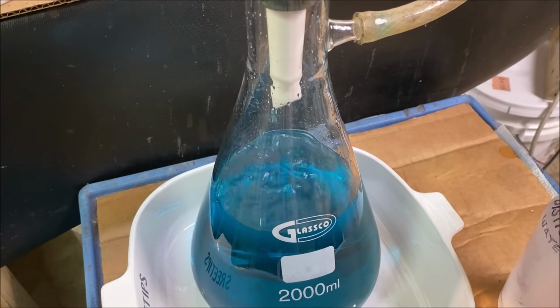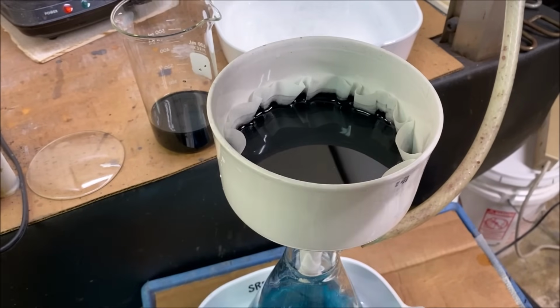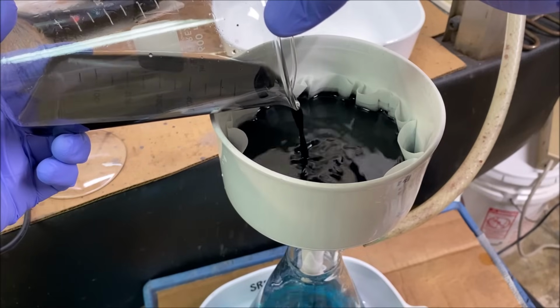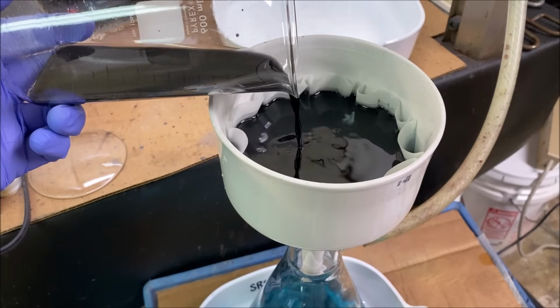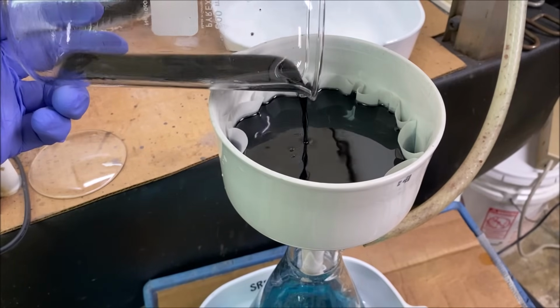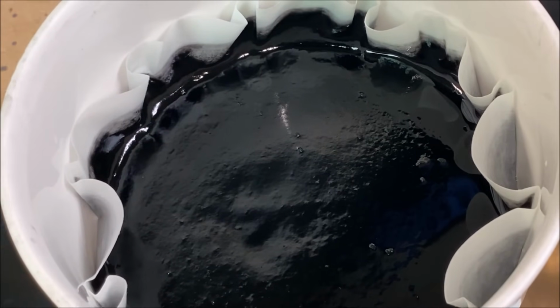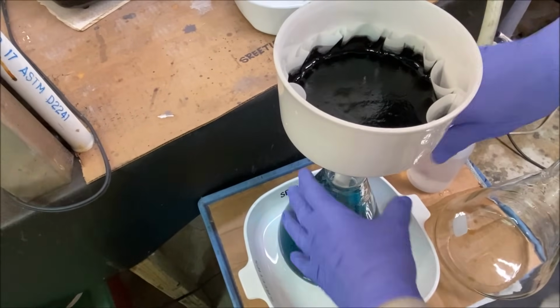Well, that's a bit of a relief. The liquid is pulling through our filter fairly quickly. So hopefully we'll be able to gather these solids in this filter and then rinse them off with some distilled water. This is moving along pretty good. Thankfully, that's our solids that I've collected in this filter. Our flask is getting a little bit full.